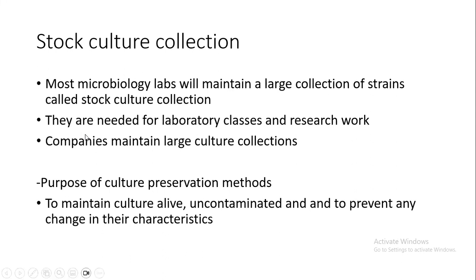So, why do we need to maintain the strains? Basically, for use of these strains for laboratory classes and research work. So, we need to maintain live culture which is uncontaminated and to prevent any kind of changes in the characteristics of the culture that is preserved. So, this is the basic purpose of the stock culture collection.